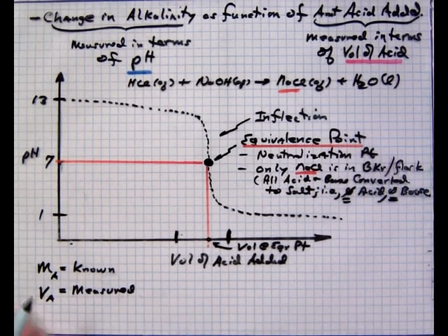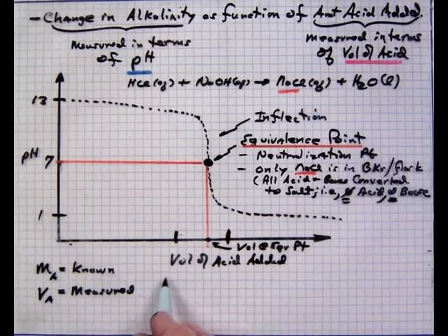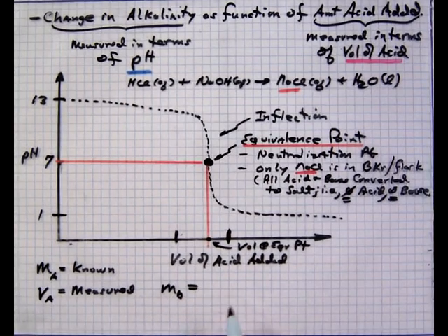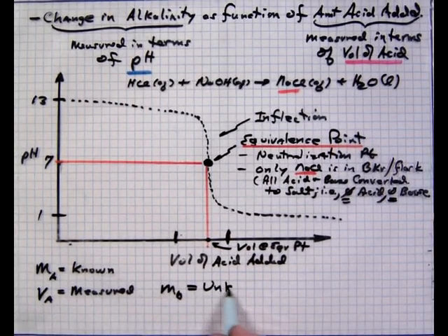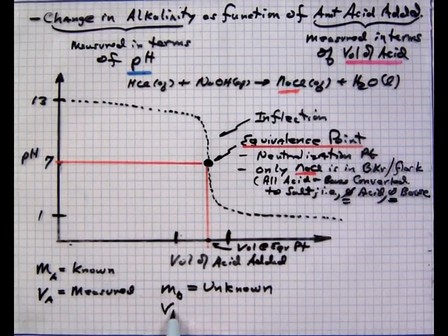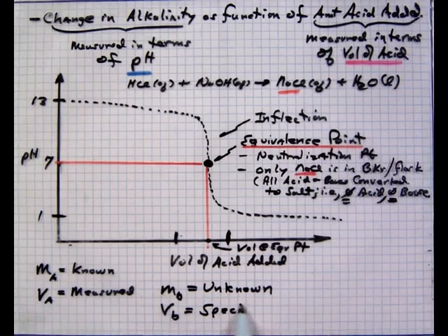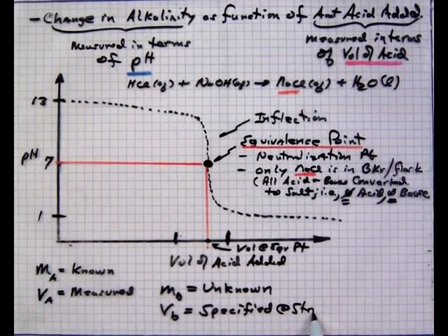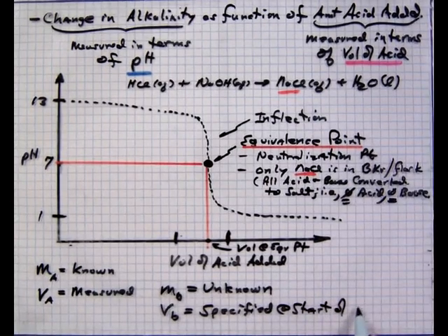Molarity of the base is the objective, the unknown, and the volume of the base is specified at the start of the titration.